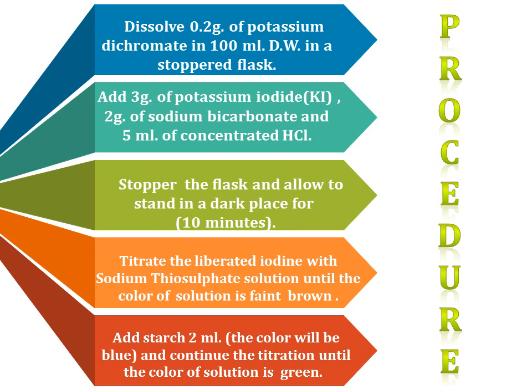Starch is added close or near to the end point, when I have a low concentration of iodine.